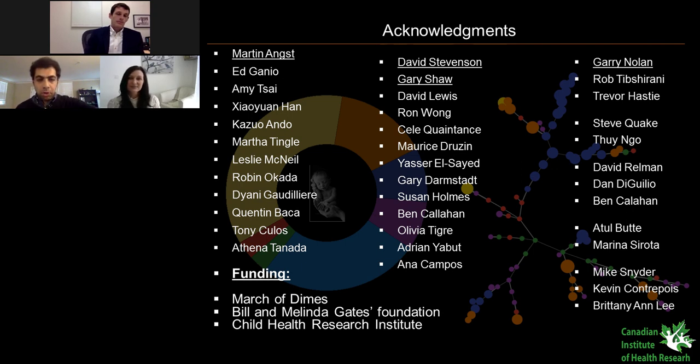When the number of measurements increases at the level that it is increasing in the cytometry field, and especially with mass cytometry, the traditional statistical answer is that you have to increase your cohort size. When you have a larger cohort, or when you have independent cohorts, you can naturally control for false positives. But that is not always possible, obviously. So the alternatives are to use the sparse models that reduce the complexity of the models to very few measurements. When you have fewer measurements involved in the final predictive model, the chances of false positives also reduce.